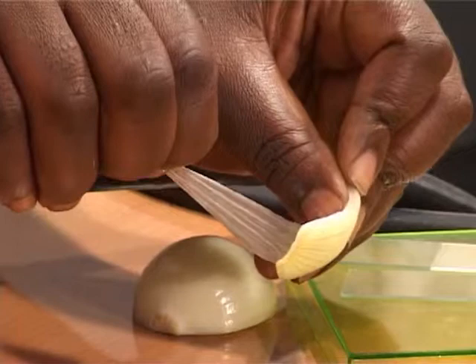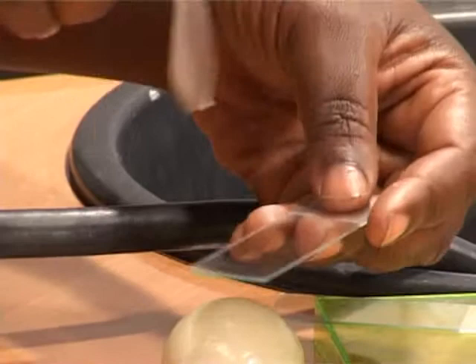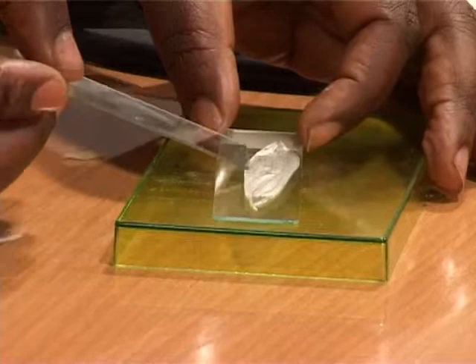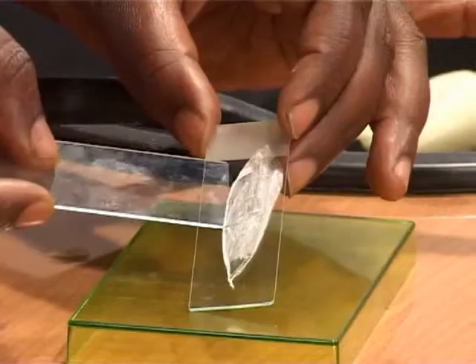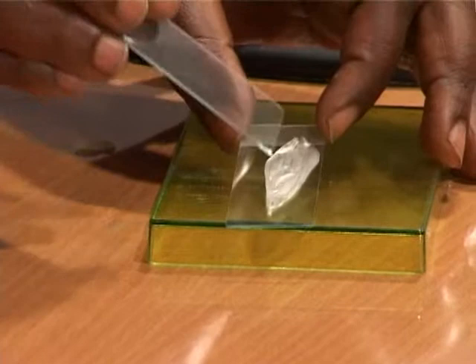Okay, learners, as you can see, we've removed it. Then you put it on the slide. This is a slide. Let us put it. Don't use your hands to touch the membrane. Okay, learners, now we have removed the skin or membrane of an onion, which we want to observe, and we've put it on a slide.